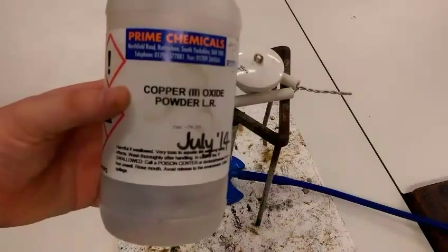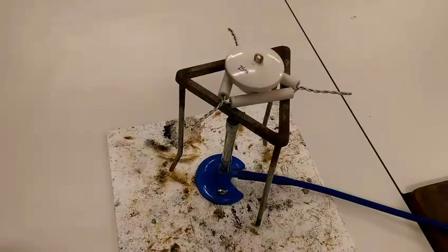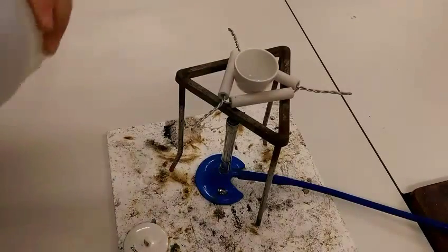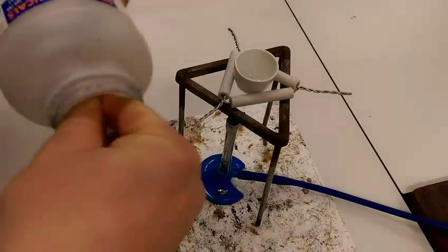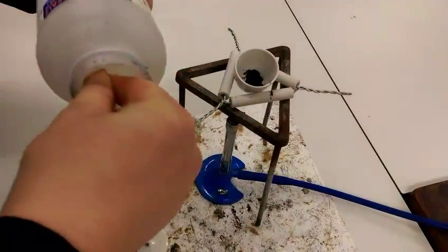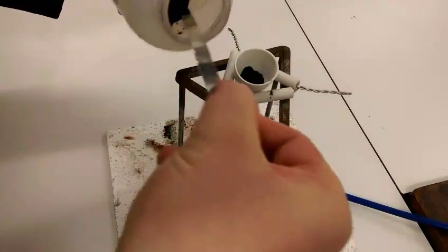This is my copper oxide that I'm going to put in first. I'm going to put roughly equal quantities of copper oxide and carbon in. I'm going to put a couple of spatulas worth in - let's do three spatulas.